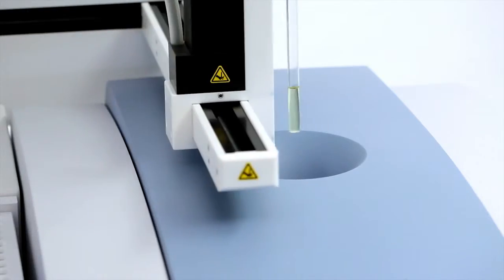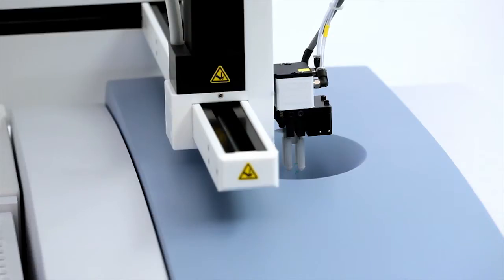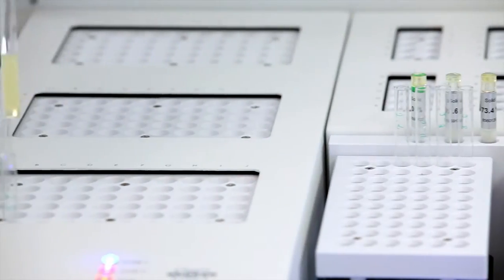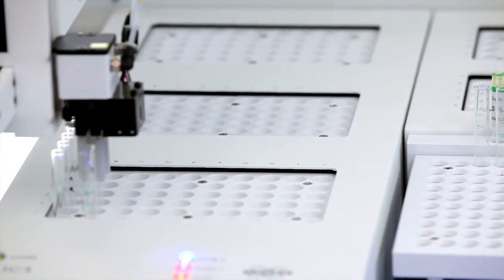Peltier technology for cooling avoids the need for water cooling baths. The XYZ robot ensures safe sample handling and precise tempering times.